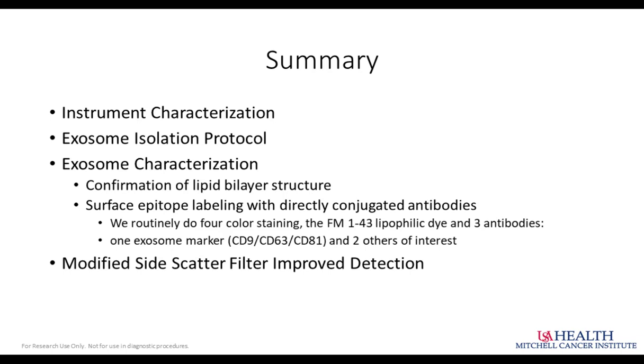I think really you have to start at the beginning. You have to start with the beads and prove to yourself that your instrument is capable of resolving those beads. I'm quite sure that some of the stuff I've told you today can be applicable to other cytometers as well. But until you do it yourself and prove that you're actually resolving all of those little silica particles, there's no sense in even doing any exosome preparations.